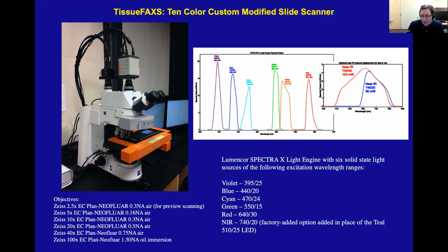Most microscopes are limited in the number of colors you can image. Typically, you'll have a DAPI channel, so the blue, and then you have a green, red, and a far red. So FITC, rhodamine, and Cy5. So we added that 5th color. And my goal was to add more, because the turret on the microscope could take 10 cubes, so I thought, well, okay, we could do 8 to 10 colors. How could I do that?